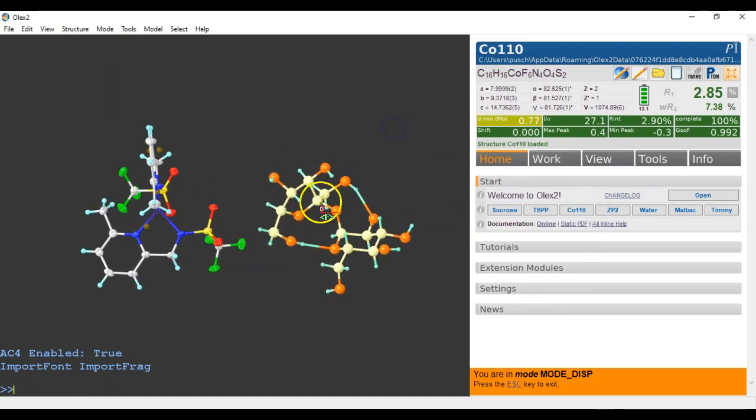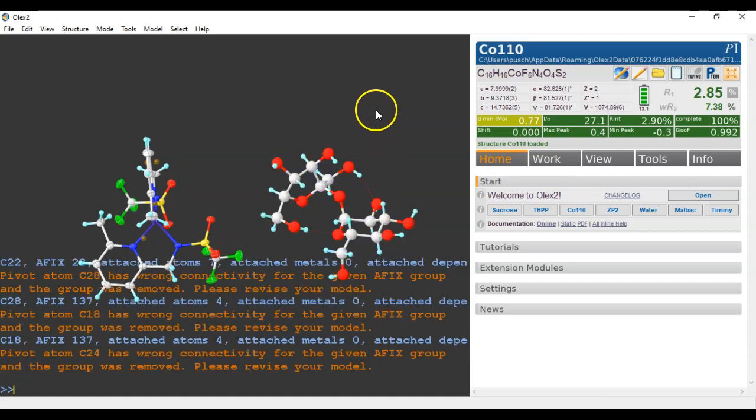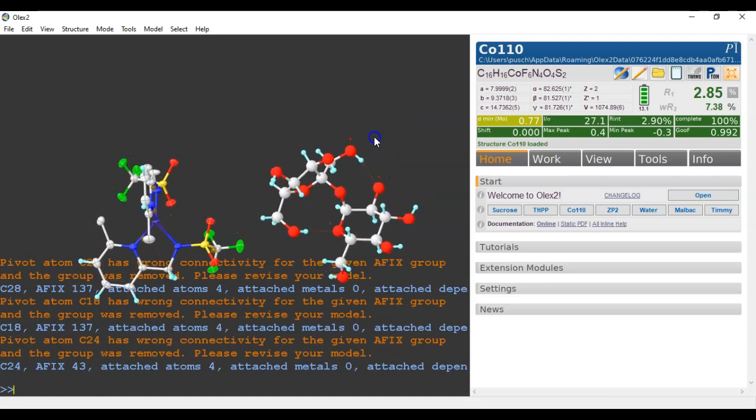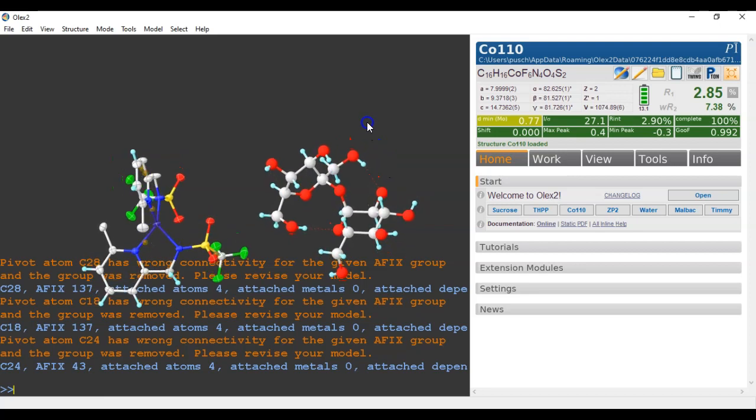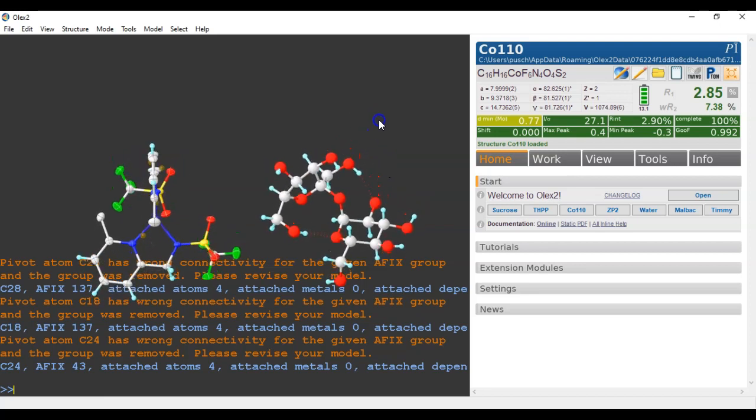And I can move this about as well with shift and the left mouse. I can move this into any position I like. And of course, there's now going to be a lot of crystallographic errors. That's to be expected.